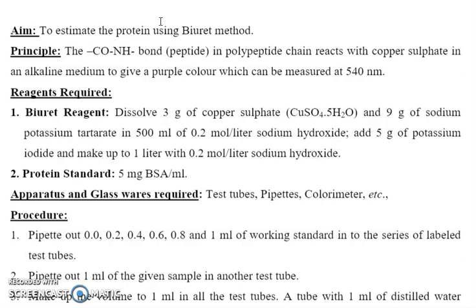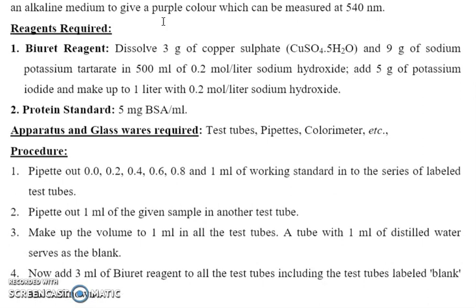The protein standard is 5 milligram BSA per ml, bovine serum albumin. Now the apparatus and glassware required: test tubes, pipettes, and colorimeter.